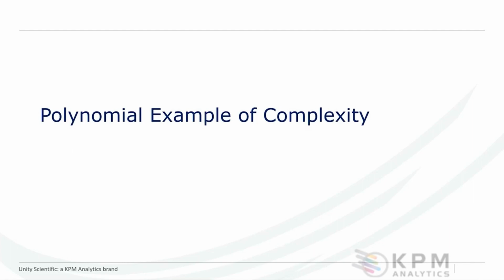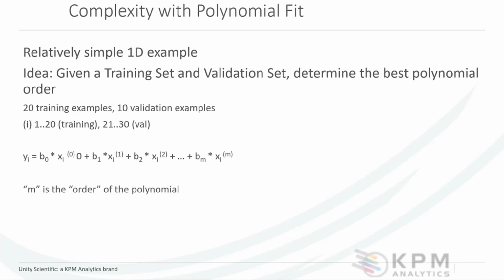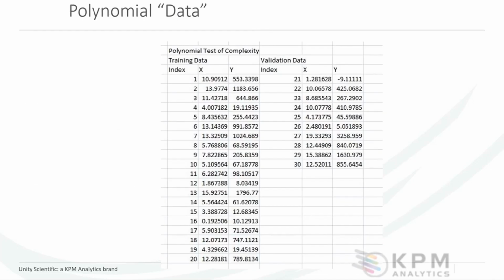One small part of the software also uses polynomials. The area of the software that I've used that uses polynomials is when we're calculating instrument transfer calibrations, okay? Complexity in a polynomial equation is listed here. We've got the exponents, 0 order, 1, 2, and up to whatever. The exponents describe the order of our polynomial equation.